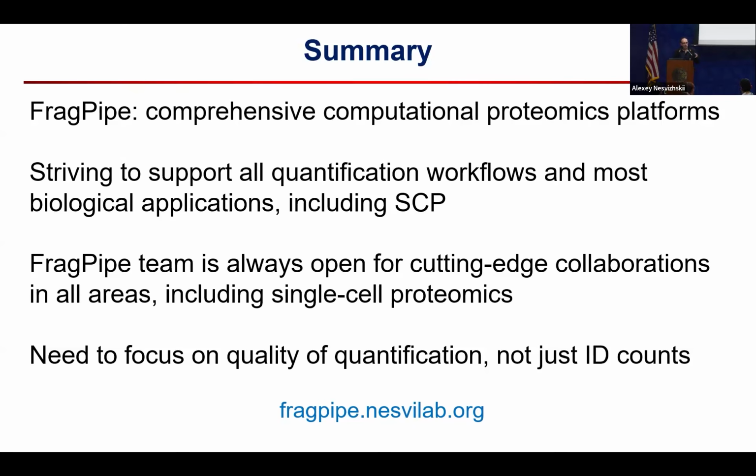And we have this razor assignment, and most other tools do that. And we use DDA strategies for DIA data as well. Now, what's done in other tools, they say that they also do protein inference and try to assign peptides to protein accession numbers and genes in a consistent way. But it's a little less known what exactly those tools are doing. But yes, no matter what, we have to deal with this protein inference problem of shared peptides.